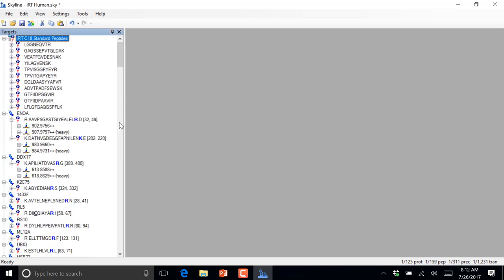There's the ability to import documents into other documents, and there are lots of variants of that, powerful things you can do. That part of it came from Andrew Strigacci. He had 100 different documents to measure all these different proteins when he was doing express proteins, and he just wanted to zip that all up into one document, and that makes that possible too. But so now we have our standards.